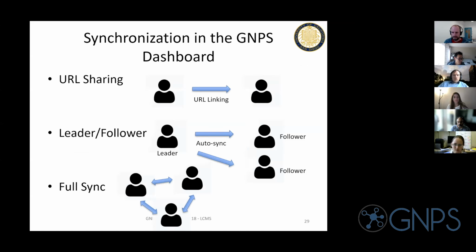Okay, so here's a question. I'm trying to visualize my own private LCMS data deposited in MassIVE, even though I can import files from MassIVE. Okay, yes, so this is a problem. If you make a private MassIVE data set, so this is not something where you've done an analysis with a GNPS task or anything, if it's literally a private MassIVE data set and you have the MSV accession, those are not visualizable.